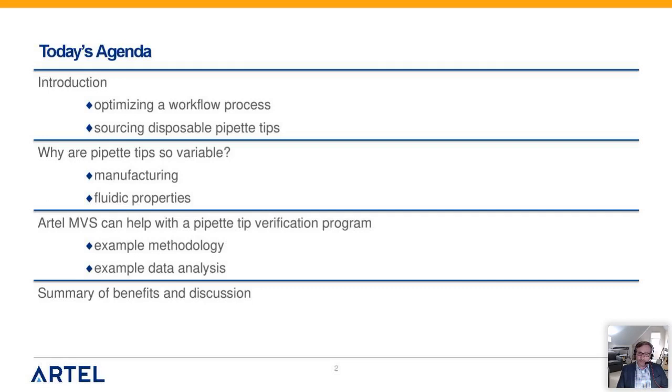spend the rest of the time talking about using Artel MVS to evaluate these pipette tips. And this is in the absence of biology, so you can set up a nice pipette tip verification program. I'll explain the methodology, and then we'll take a look at some example data analysis. And again, these are some suggestions that we'll talk about, and then we'll wrap it up with a summary and open it up for discussion. And again, as Elena mentioned, I'll be here for questions, and then Marco will also be available for questions.